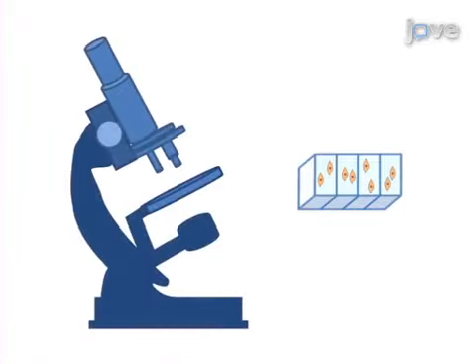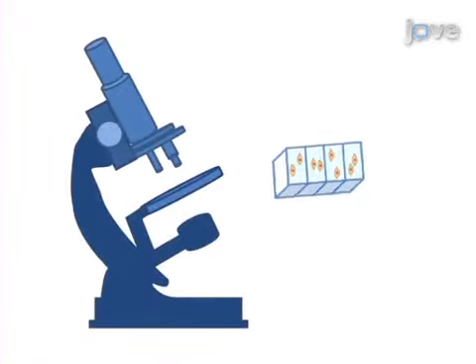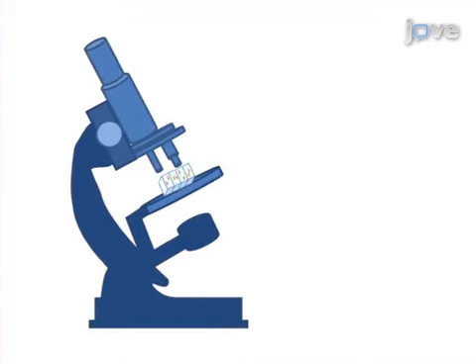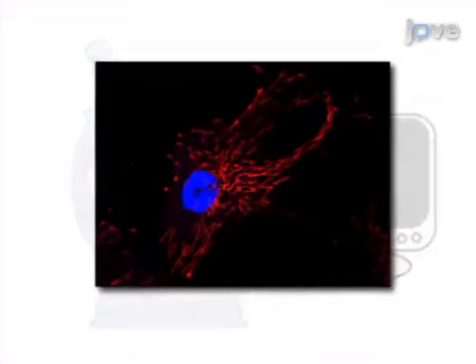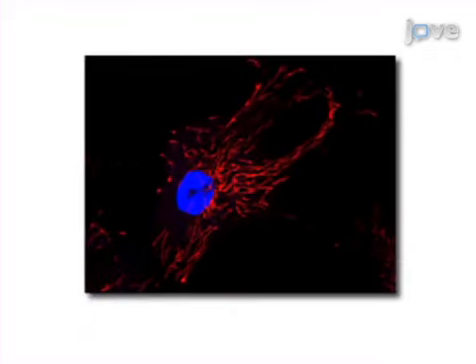After 24 to 48 hours, live cell imaging dyes are applied to evaluate mitochondrial function, morphology, or mitophagy by live cell imaging technique. Ultimately, software-based analysis of the images can reveal morphological and functional mitochondrial parameters in living human fibroblasts.